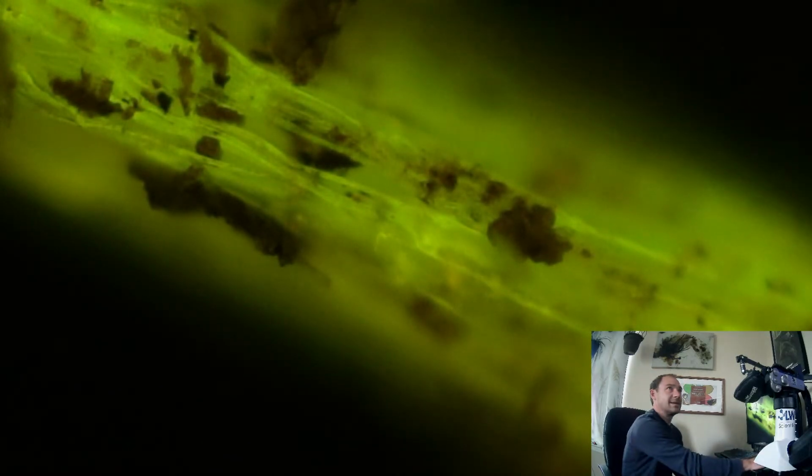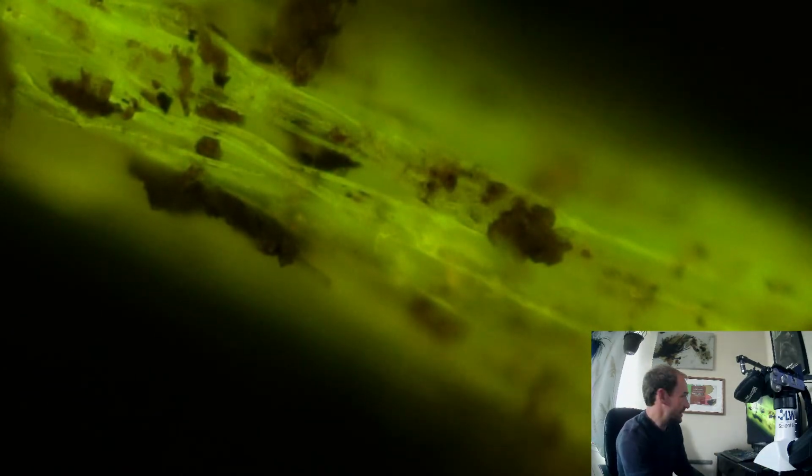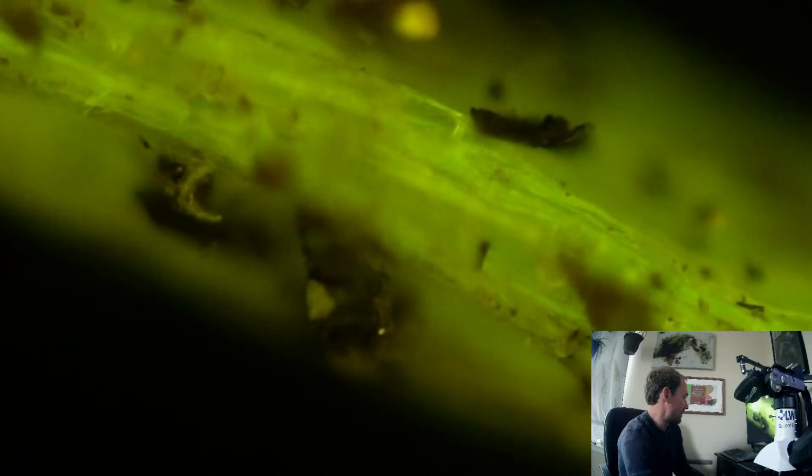Yeah, and I think a lot of these tubes aren't super square, and it looks like glowing fungal hyphae. Oh, we're getting to a super bright part up here. Wow.